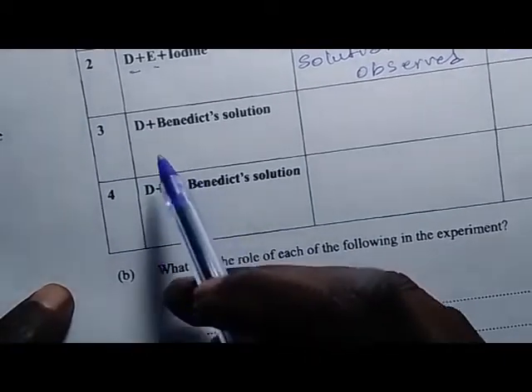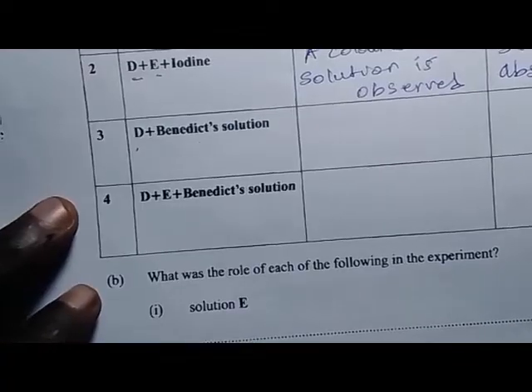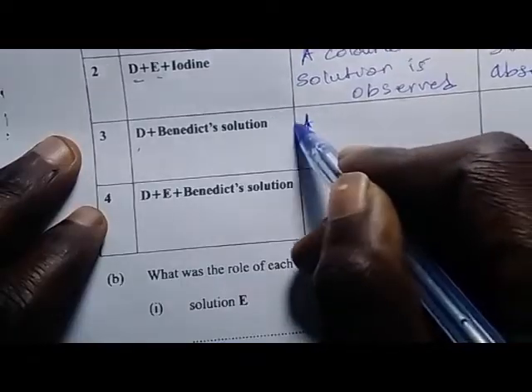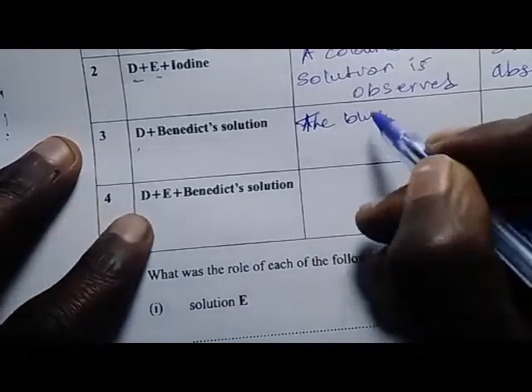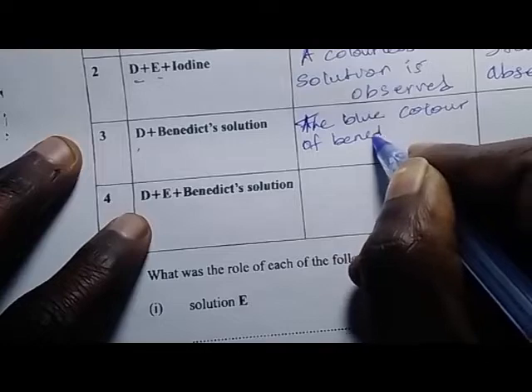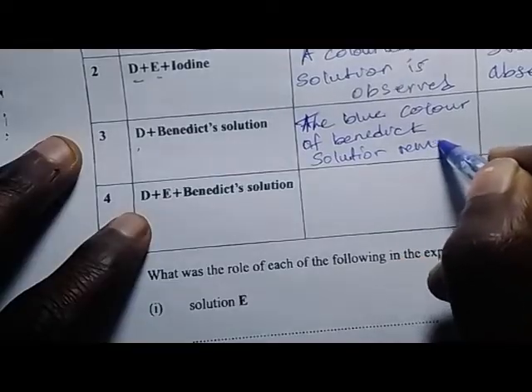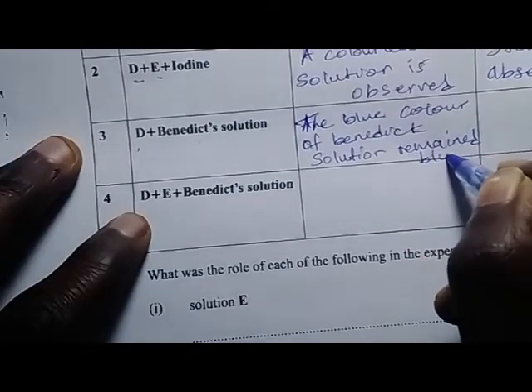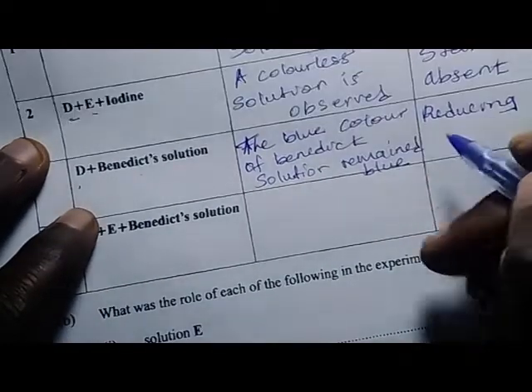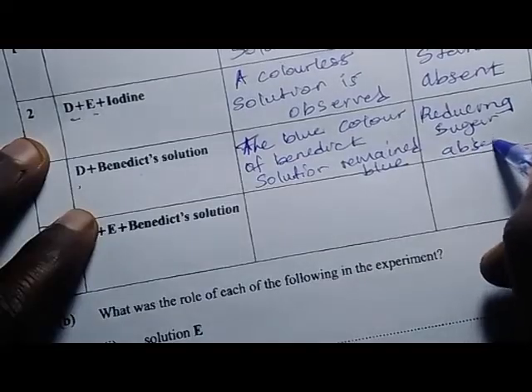Now in 3, the solution D plus Benedict solution. This means that your observation will be the blue color of Benedict solution remained blue. This shows that reducing sugar was absent. That is the conclusion.